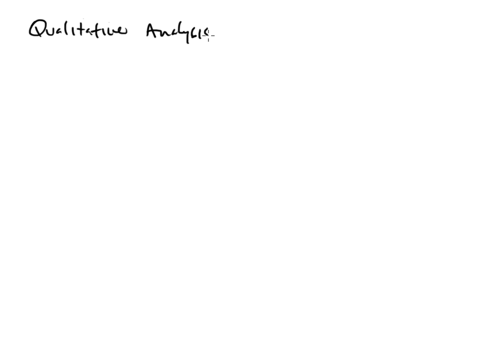What is qualitative analysis? Well, folks, that's what we're going to be doing. So we have to know what qualitative analysis means if we're going to be doing it. The reason I'm saying this is because there is another field, called quantitative analysis. Oh no, qualitative and quantitative? What do you mean? How do we determine the difference between the two?